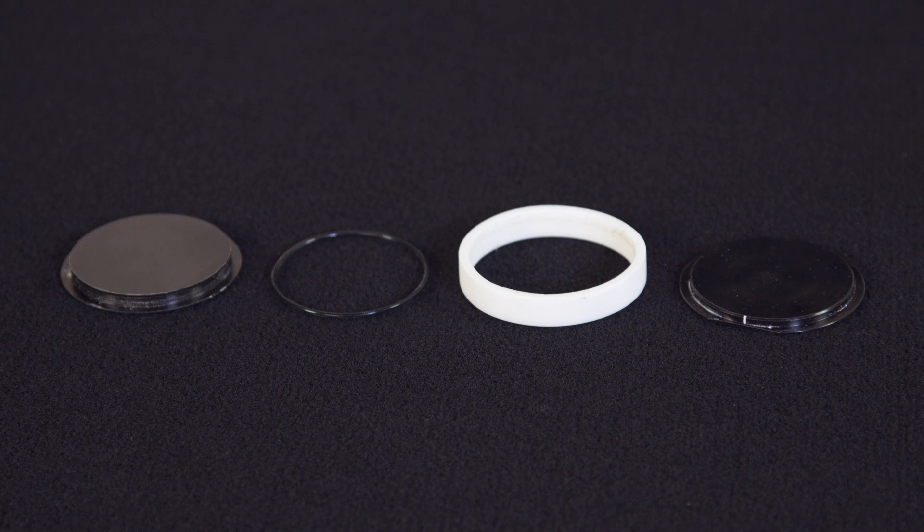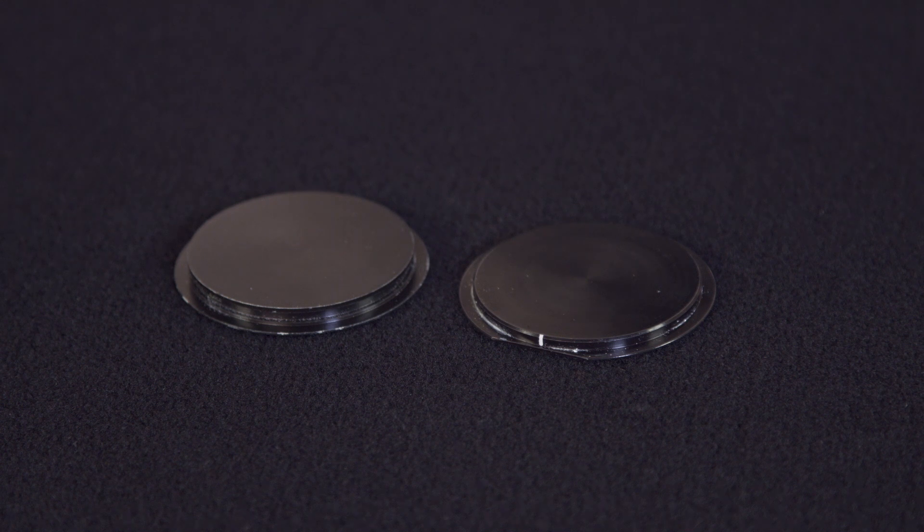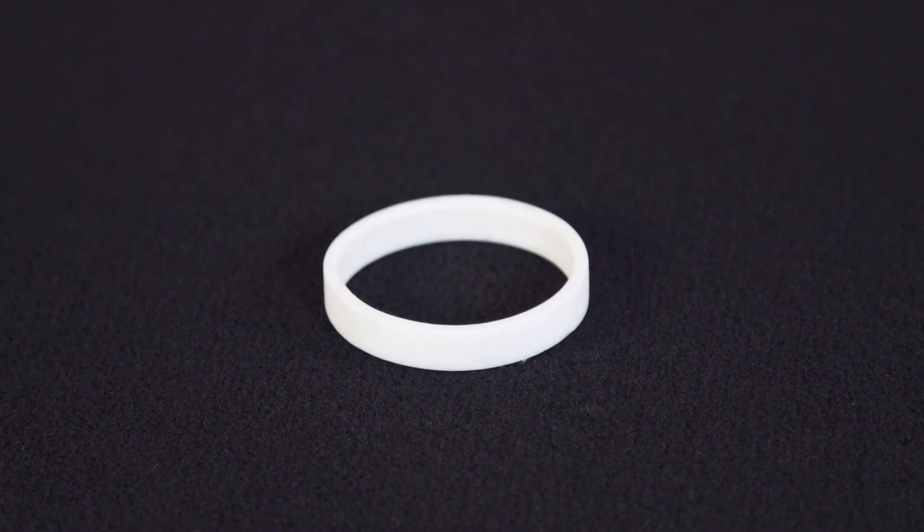Here we have the DTC-300 liquid cell. It consists of two plates, an o-ring for the bottom plate, and a ceramic ring to hold the liquid inside the cell.